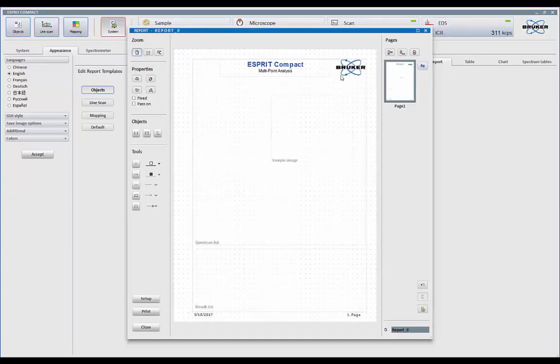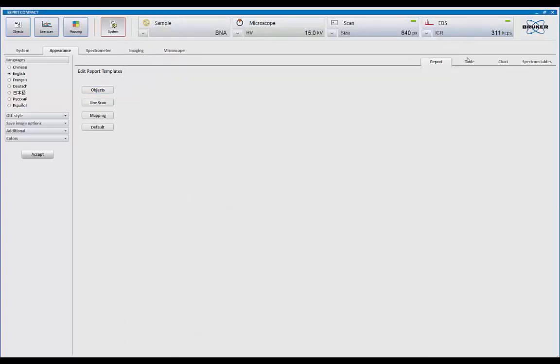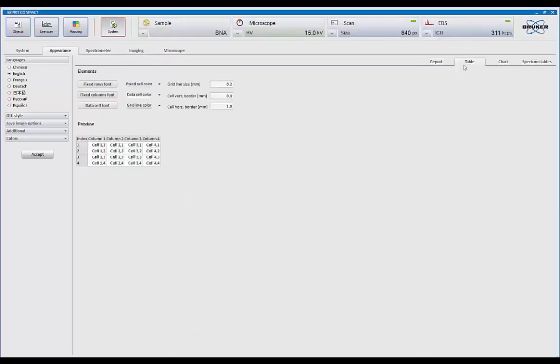You can put your own corporate logos, put as many default placements as you wish in here. Table is for the output for things like quantitative analysis. All go out in an Excel-style spreadsheet and can be saved directly.